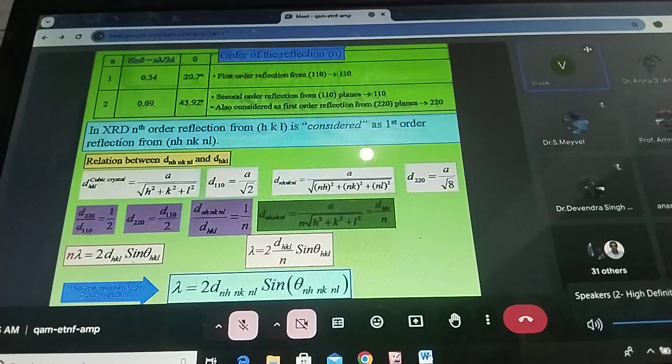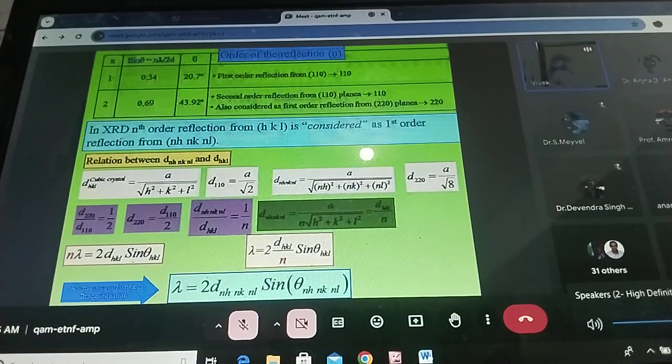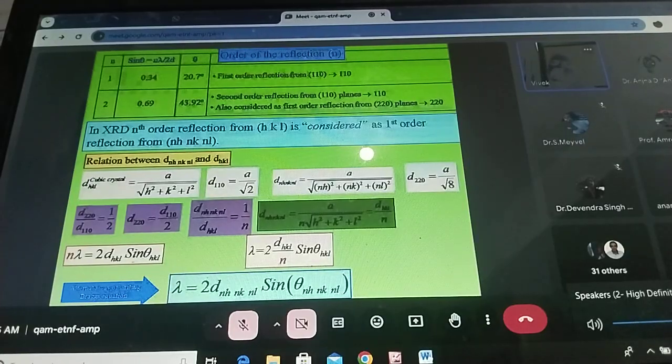Then I put the chlorine in the formula, then it takes the atomic scattering factor of chlorine, and then it does the solution. So from there, sometimes the distance is also confusing. 1.33 is sometimes a carbon double bond distance. We can also take it as OH. So it depends upon your expertise and what atomic scattering factor you are giving. If you are giving the wrong atomic scattering factor, your result never converges, it gives you an error.